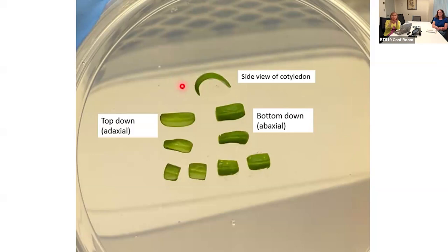And the reason we do this is because of two things. In our pre-culture system that you'll see in the protocol, if we put it top down, we have more of the surface area in contact with the medium than if we flipped it over. So for that 1 day pre-culture, those little cotyledons would start to dehydrate. So that's why we put the top down first. But then after we do the infection, we flip them, because then you have the cut edges where the agrobacterium got into the cells, so that you have better selection on those cut edges.